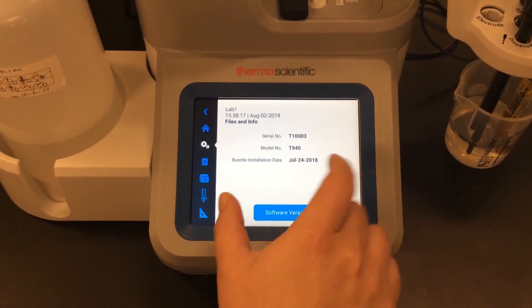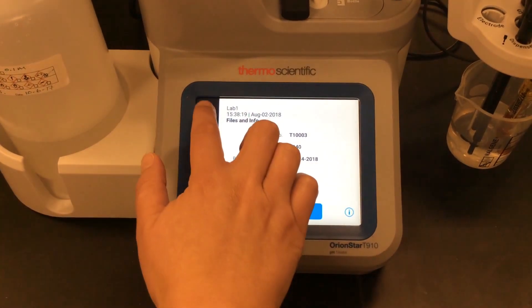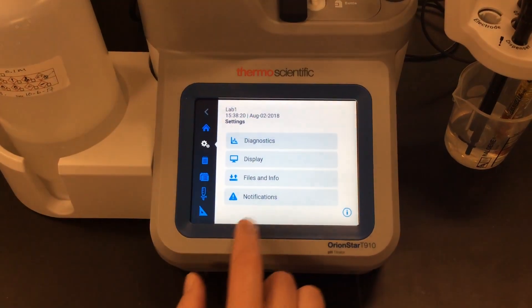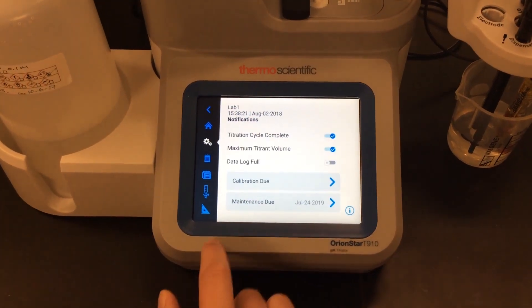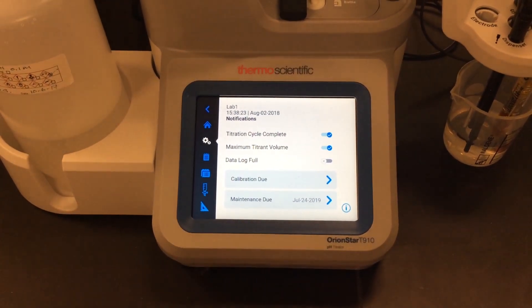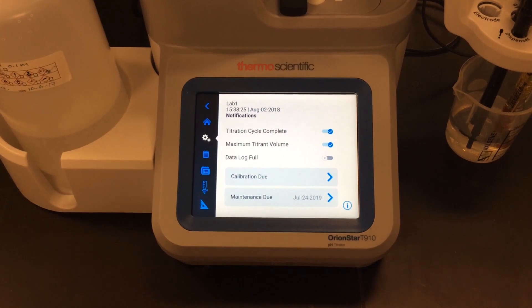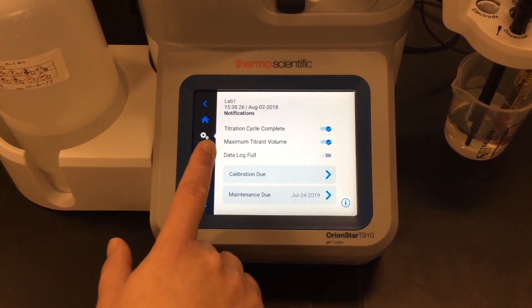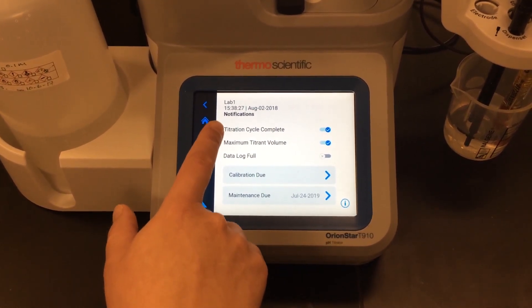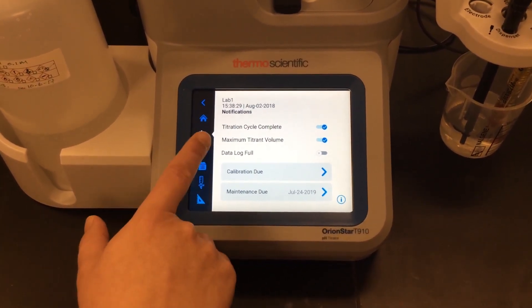If I want to know my titrator's serial number and model number, I can look right here on the files and info screen. Lastly, I have the notification section, which allows me to set an audible alarm when my titration cycle completes, if I reach my maximum titrant volume without hitting an endpoint.